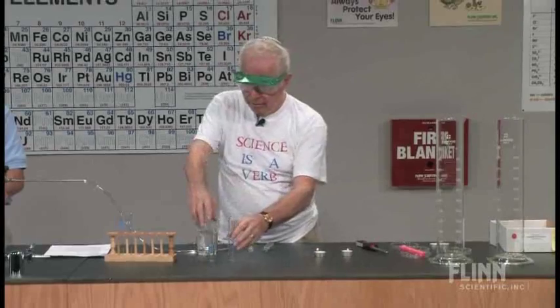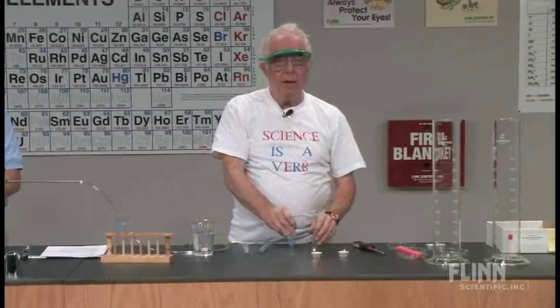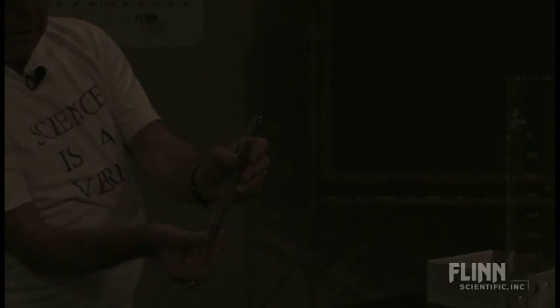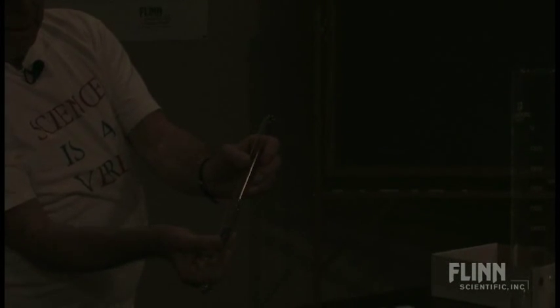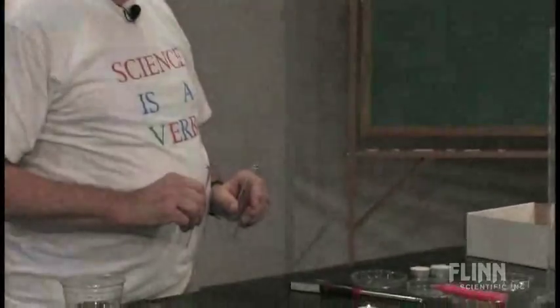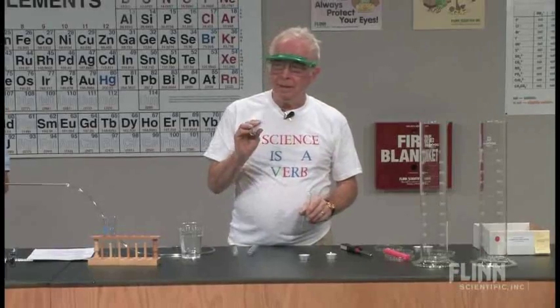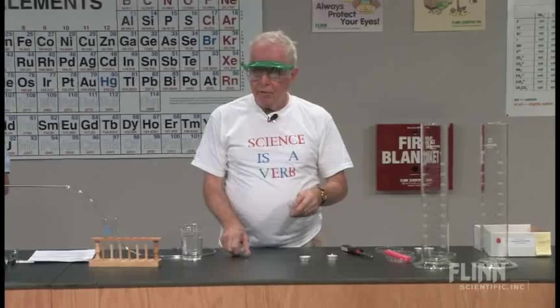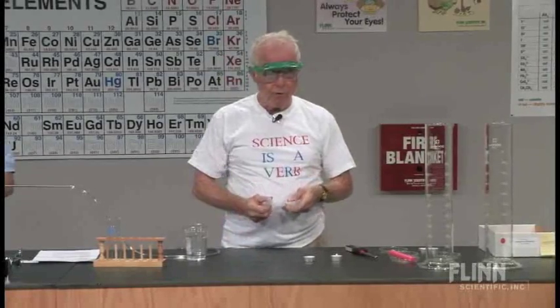Let's do that again just in case you didn't see it before. Dim the lights again please. Now this is the part that has to be done quickly, and sometimes it works and sometimes it doesn't. Notice the difference — this time it didn't ignite.